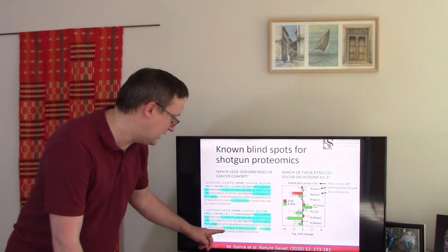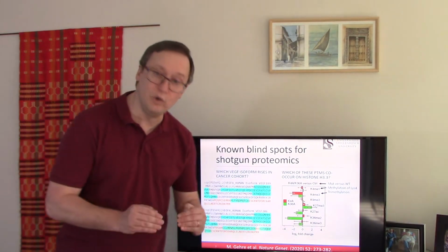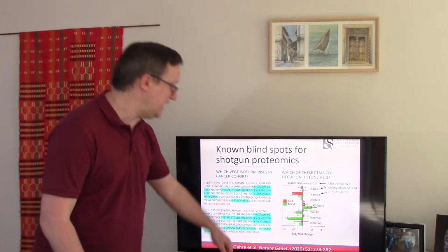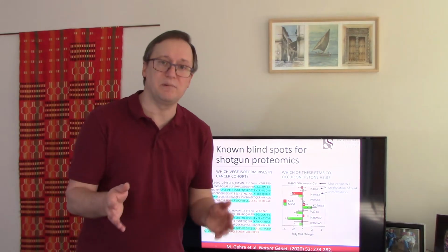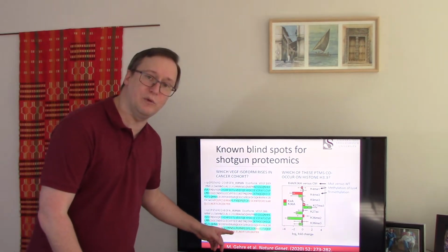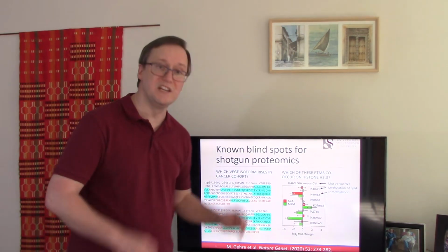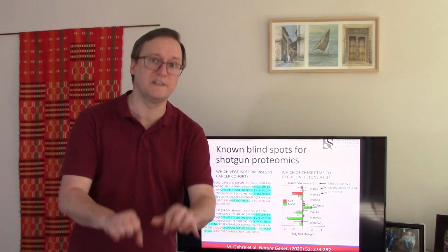We do, however, have a peptide down here in CCLMP that is only found in VEGF206. So if you were to identify any of these peptides except for the CCL one, you would not be able to discern whether VEGF189 or VEGF206 was present. The only information you have that explains that 206 itself is present is this peptide that is specific to its sequence, is explainable only by its sequence.